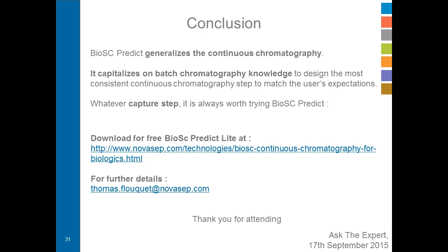So it knows, for example, if I was increasing the loading velocity up to 1,000 centimeters per hour, the software knows that it can't reach such a high speed because the breakthrough curves will not be very steep. So it knows that won't be possible except if you put, for example, 15 columns in series. So it is taking into account thermodynamics and kinetics both.